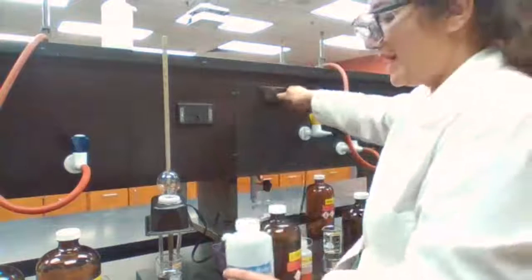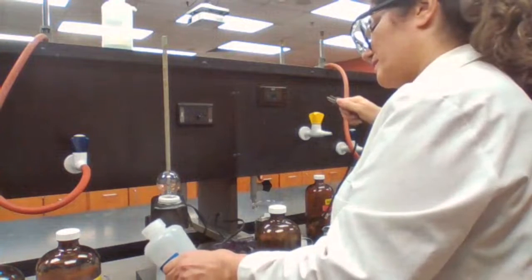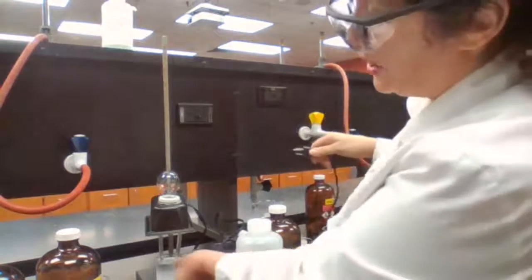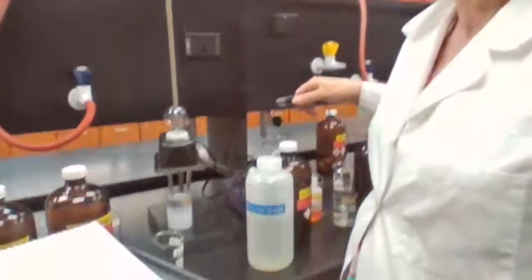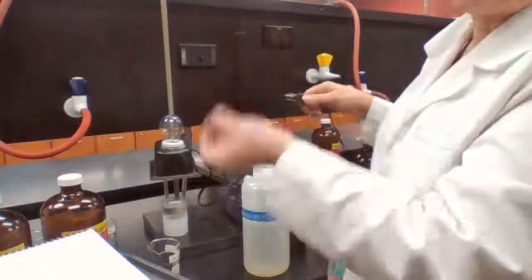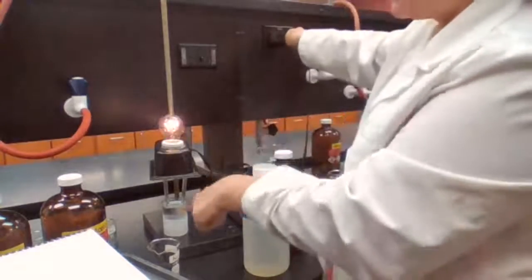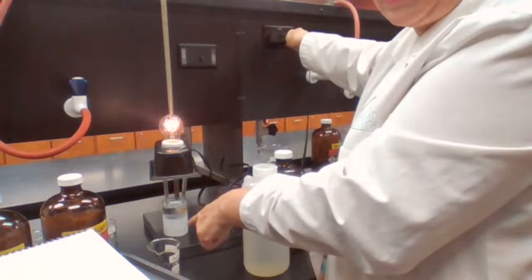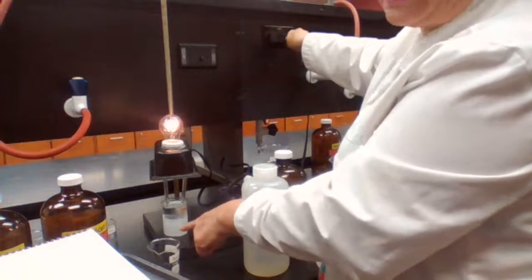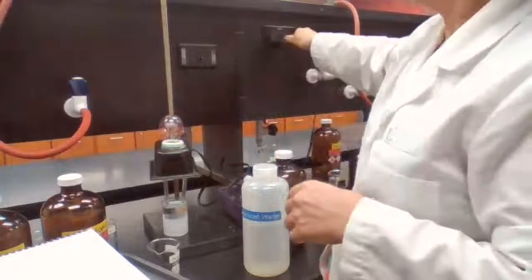But what's going to happen if we add water to the same mixture? We get two layers. The top layer is toluene. The bottom layer is going to be water plus the acetic acid. So toluene could not ionize or dissociate the acetic acid, but when we add water, it actually could dissociate the acid. So this is just showing the effect of solvent.